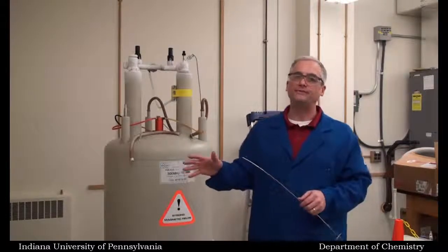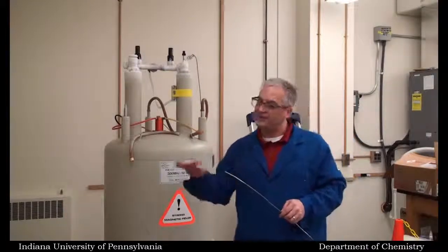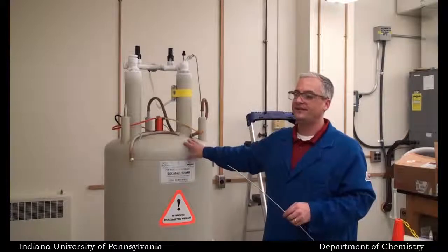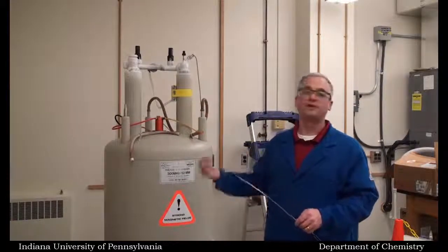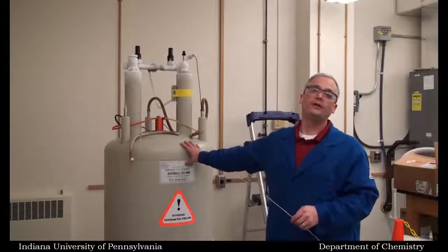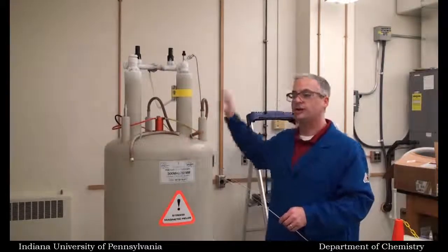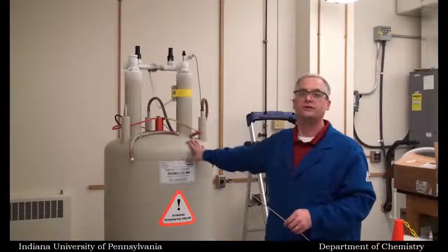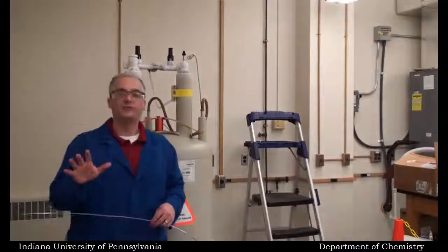I've heard of people being lucky on the 7th day. Maybe not a full 7 days, but on the 7th day they can still get away with it. But right at that point, the Dewar is so low, you put in some fresh liquid nitrogen, and the transfer process, sloshing around, you're really running the risk of quenching the magnet. Even if there is liquid nitrogen, just the act of transferring is enough to cause it to quench. So, in terms of number of days, I do it every 5. So if I forget on day 5, I can still come in on day 6 and I'm okay.